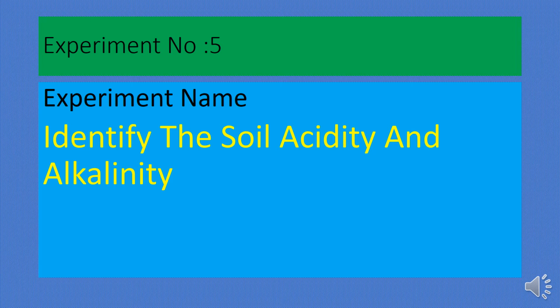Today I will discuss experiment number 5, and the name of the experiment is Identify the soil acidity and alkalinity.